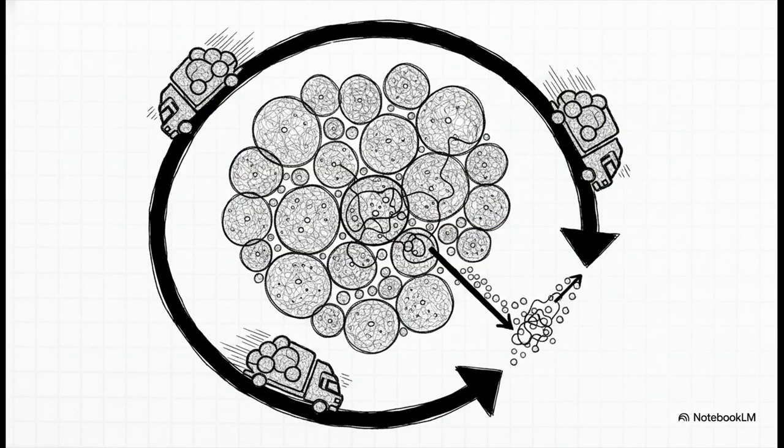The source material provides a fantastic, highly relatable way to remember this concept, the traffic analogy. If you compare molecules to vehicles and the pores to a city traffic network, it clicks perfectly. The big molecules are like huge transport trucks. They can't fit into the narrow, winding city streets, so they just take the highway bypass around the whole city and get to their destination incredibly fast. The small molecules, on the other hand, are like compact cars. They take the off-ramp, get into that porous network of tiny city streets, and get slowed way, way down. Because of this, the big molecules always exit the column first, and the small ones exit last.